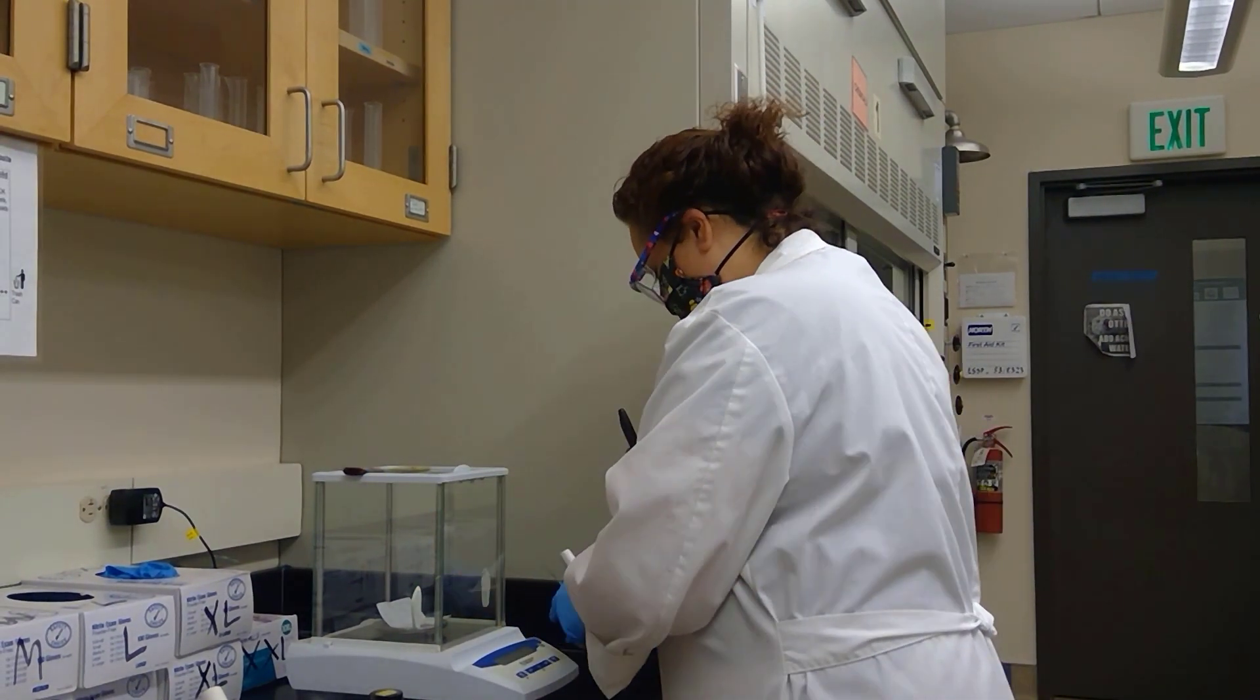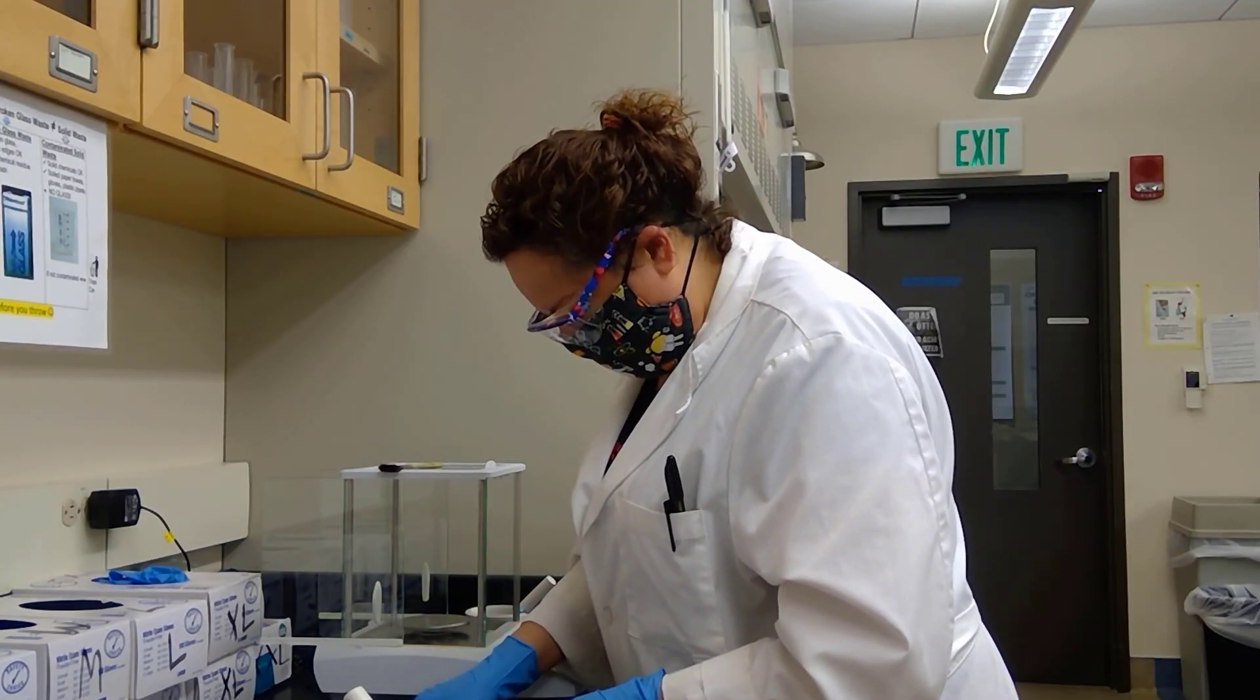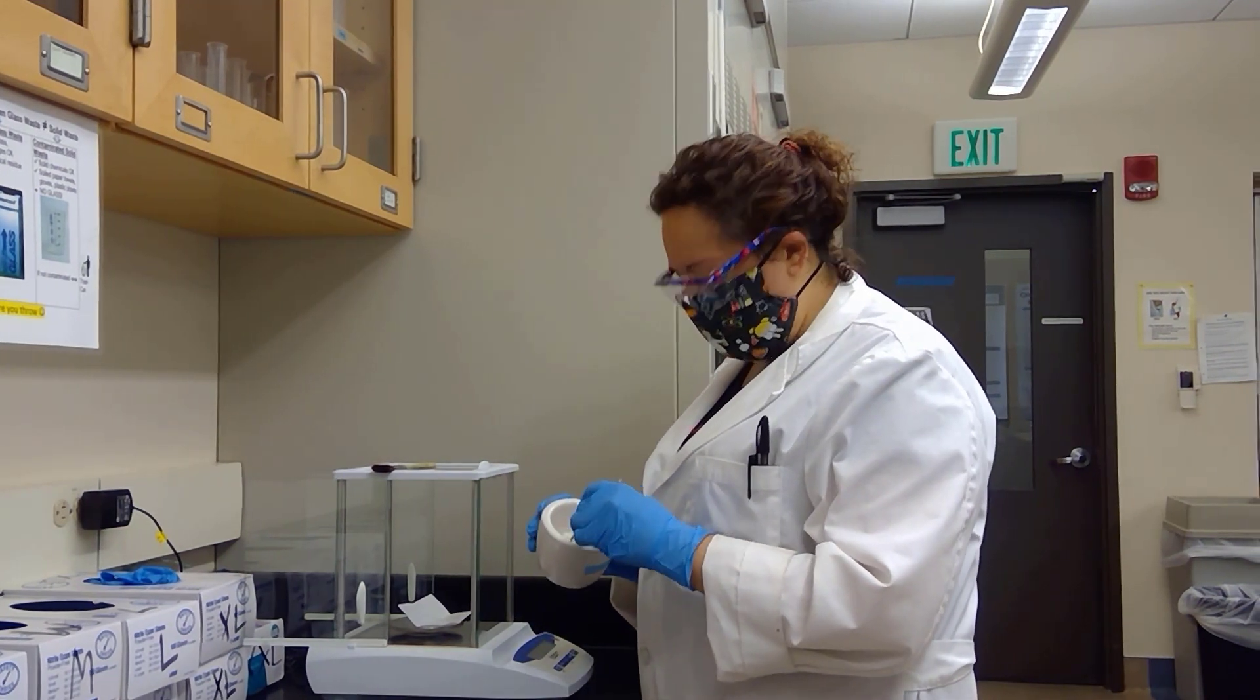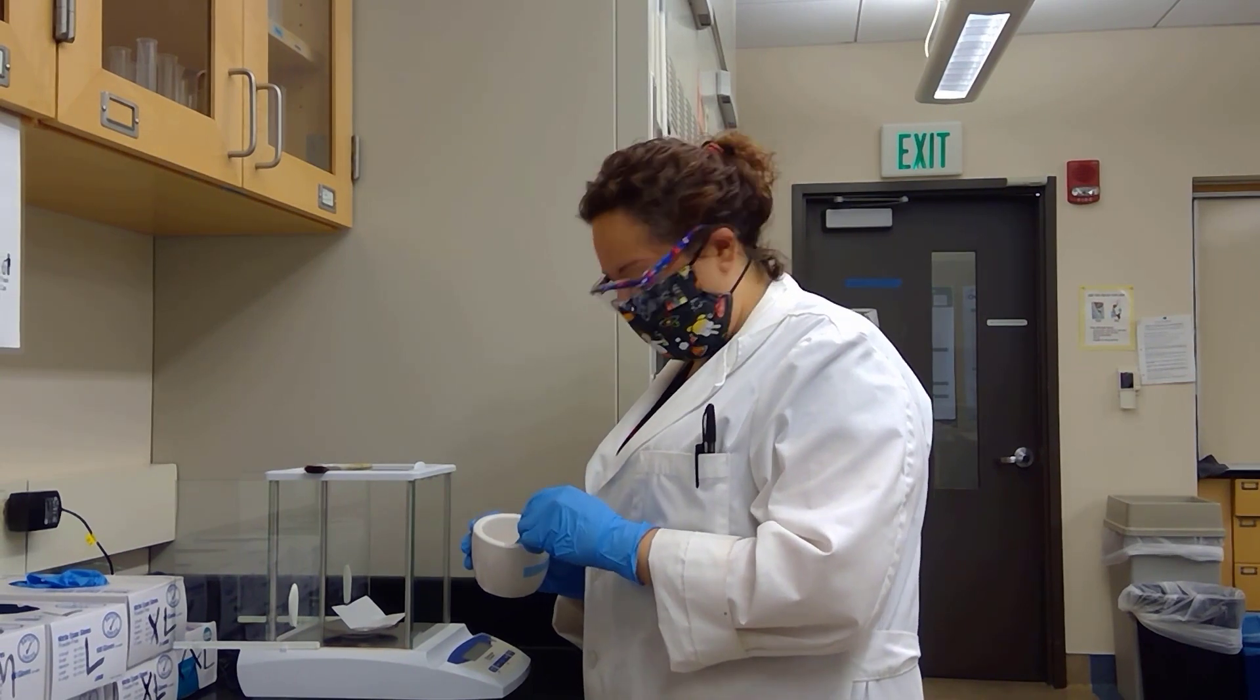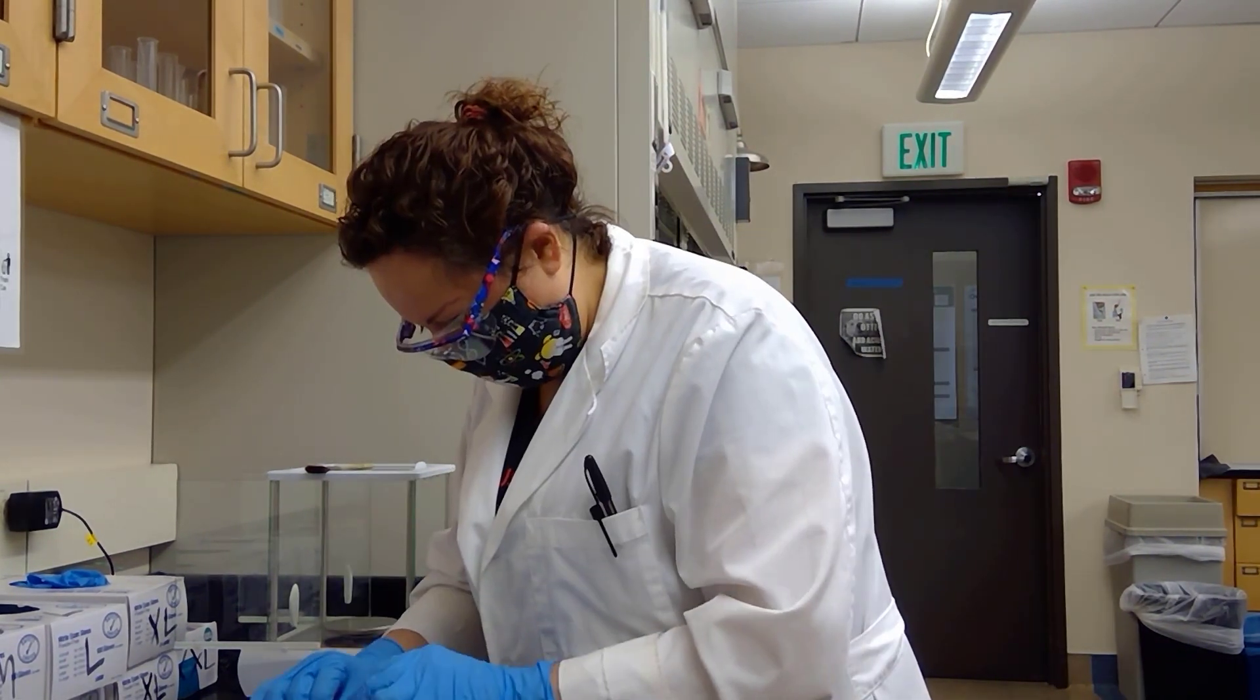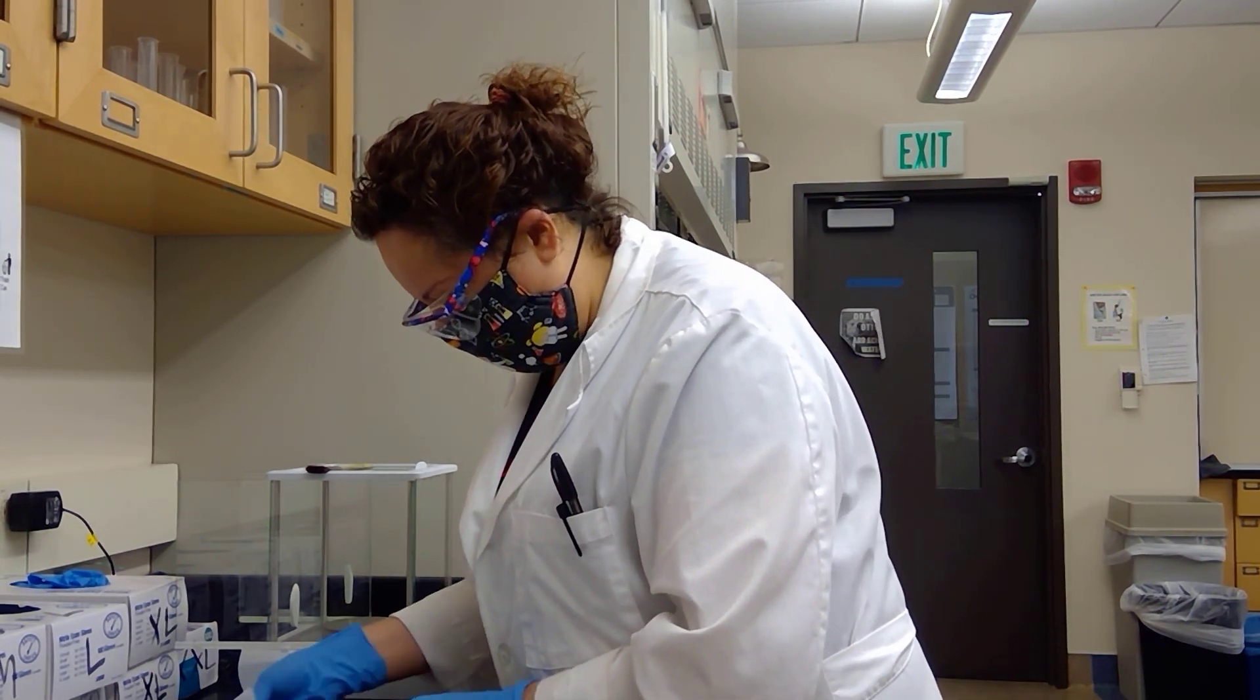Now I'm moving on to my potassium carbonate. Next up we are measuring 0.28 grams of potassium carbonate and we will also add it to our round bottom flask. Now that I have my two solids, I will begin adding my liquids.